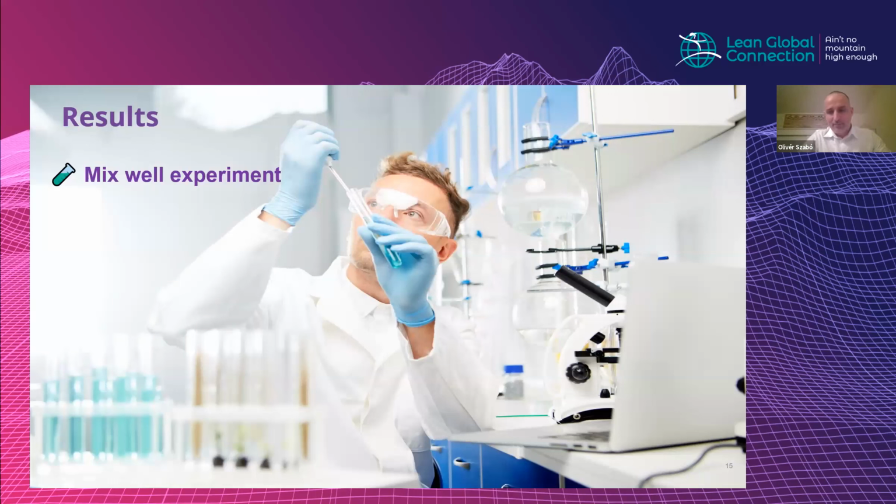From time to time, it can happen that you cannot find anything in the literature, and you couldn't learn this at university. Therefore, you need to do some exercises to find out what will be your standard test procedure at the end, I mean the procedure for your preparation steps. What is also very important is that you have to be your own TWI trainers. Obviously, at the beginning we had 0 who knew these techniques, but 4 years later, we now have 14. The whole population in the lab is around 70 people, so this ratio of 1 to 5 is, I think, quite feasible and reasonable.